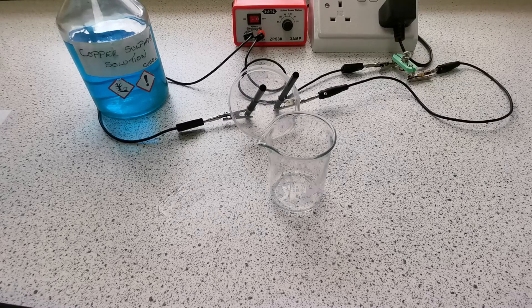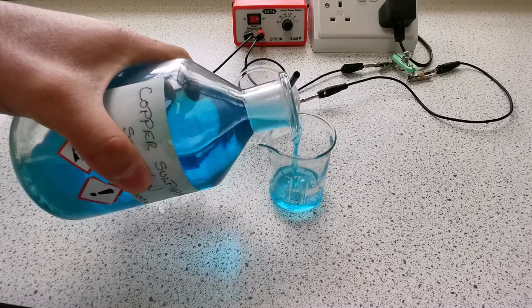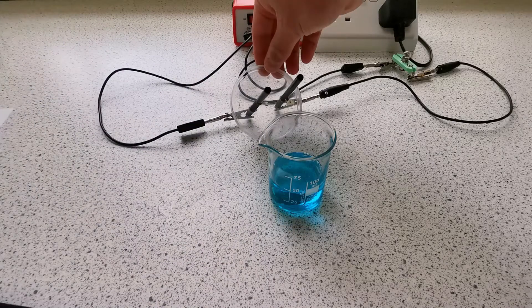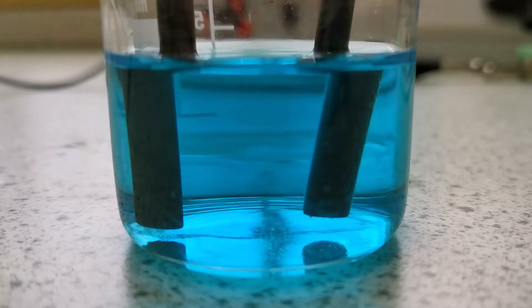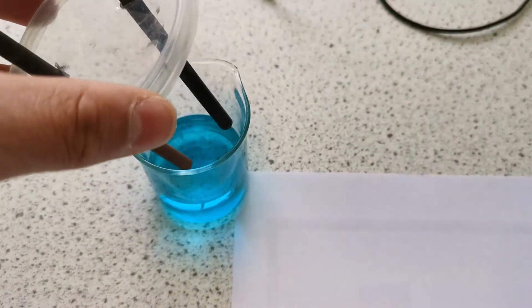The last solution we're going to do is copper sulfate solution — once again 50 milliliters. I'm going to put the electrodes in and turn the circuit on. As you can see, there is a gas being produced at the anode and no gas being produced at the cathode. As we lift the electrodes out of the solution, you can see that the colour of the cathode has turned orange-brown, indicating that it has been plated with copper.